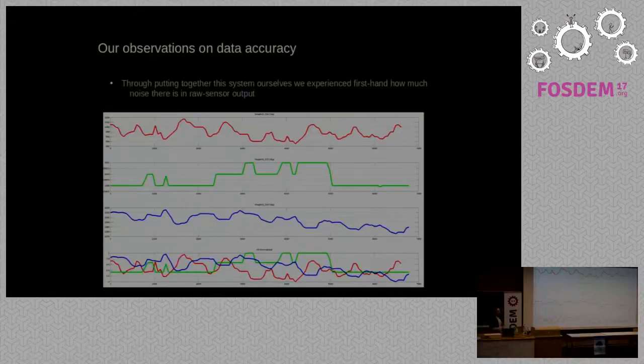And the problem is on these commercial proprietary systems, you get straight lines back. You don't know what sort of averaging algorithm they're using, what sort of sanitization of your data they're doing, which is kind of scary, because then if you're using this for scientific research, you don't actually know what's happened to your data in this process.